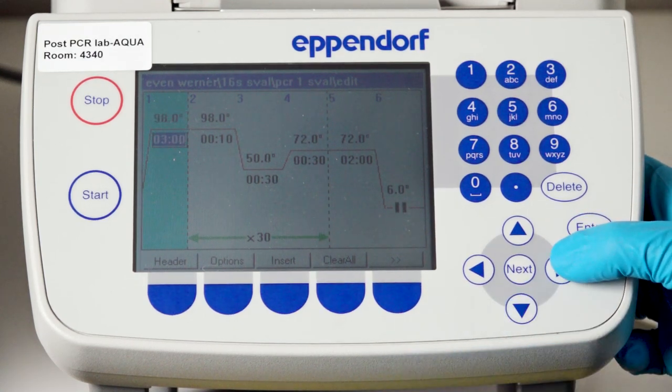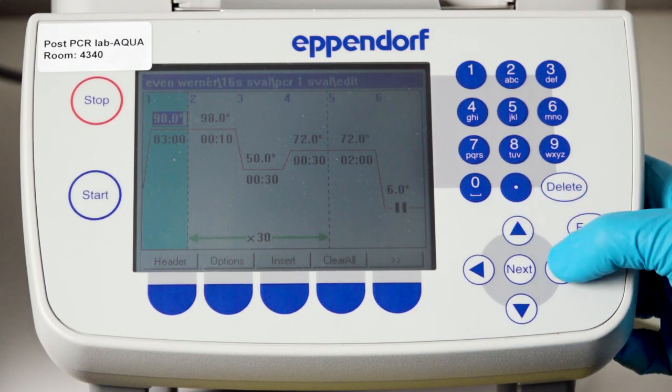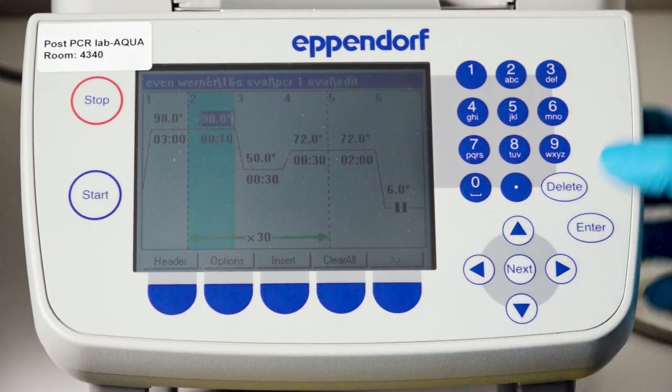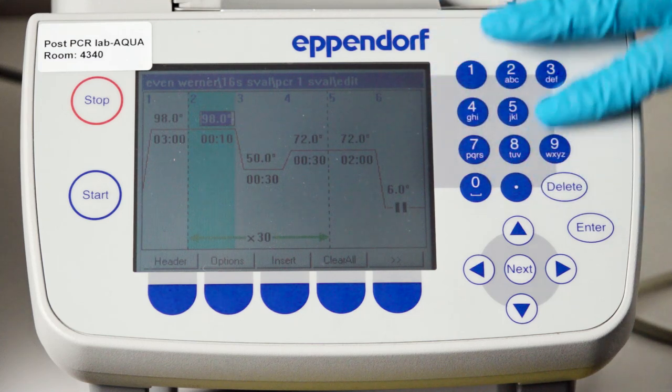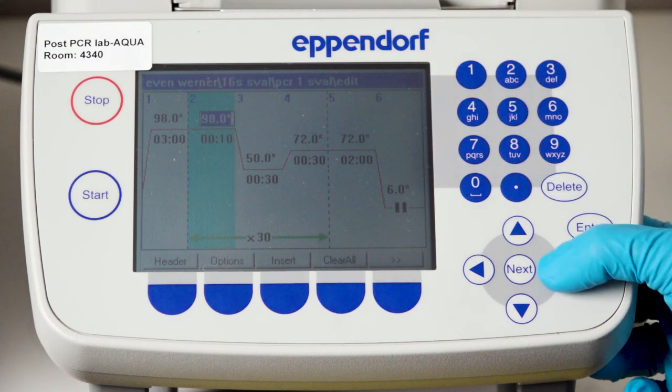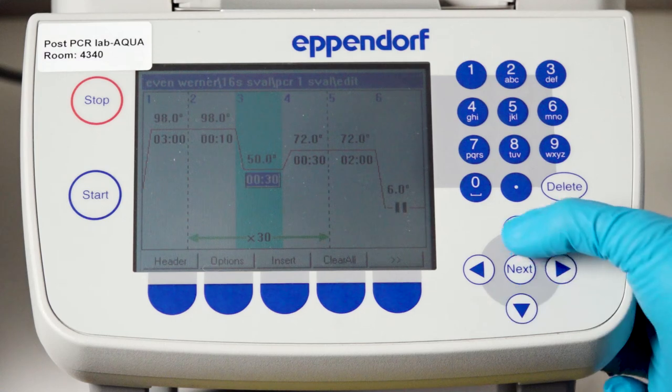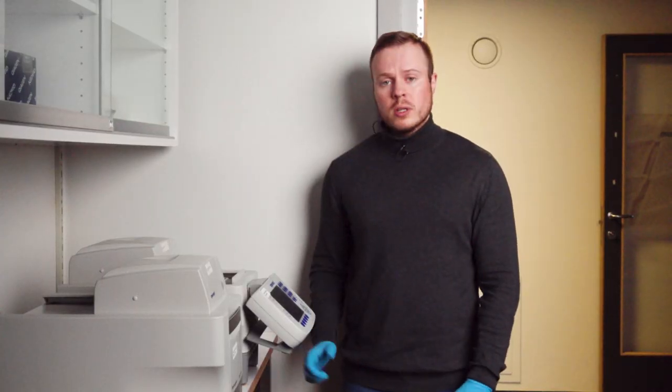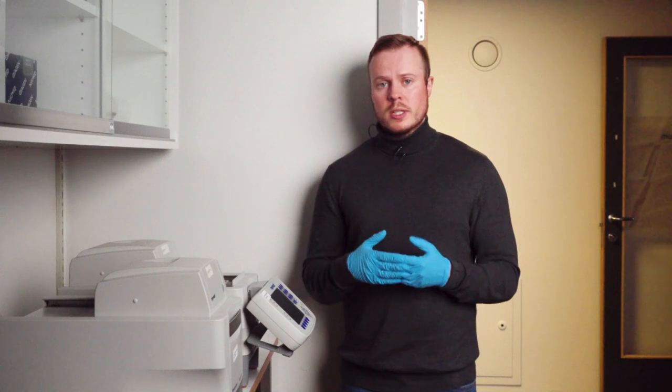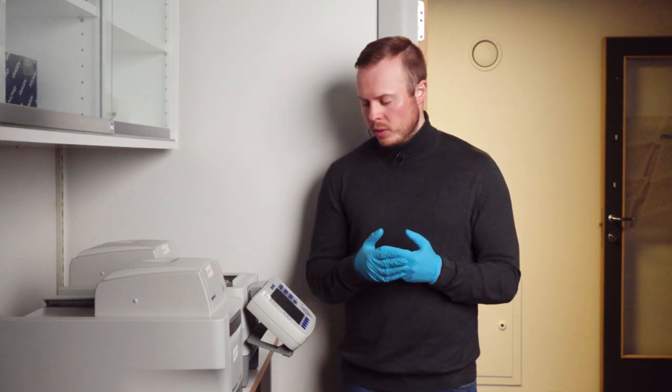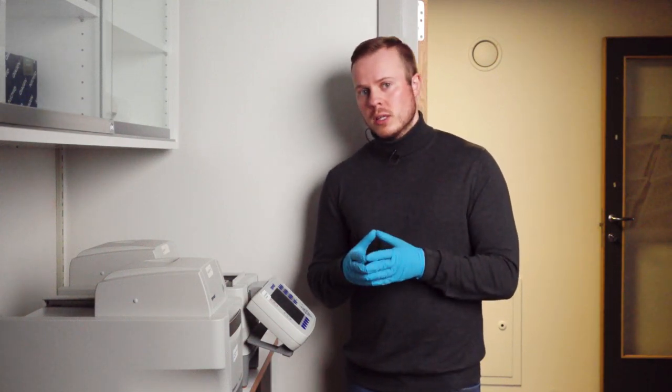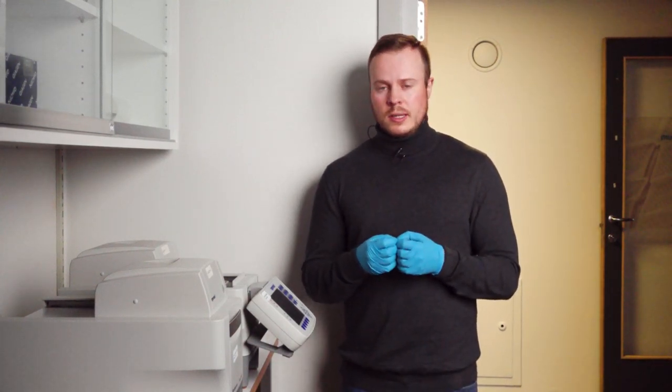Here you have the temperatures and the time, and you can just move between it with the keypad or with the arrows. You can then modify it with all the numbers here. You need to read up on your primers, but you also need to take into account how much DNA you probably have in your samples, because this is very important when it comes to the amount of cycles.